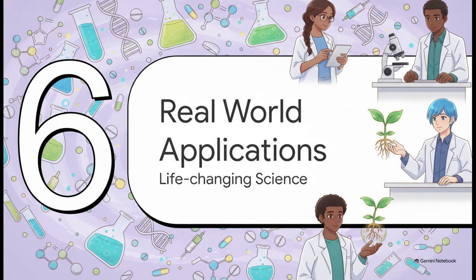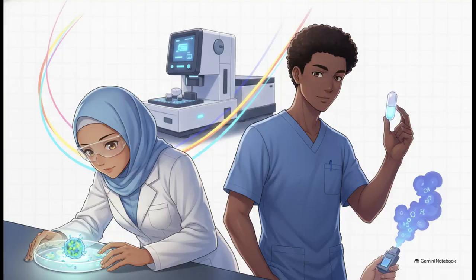And finally, Section 6, Real-World Lab Applications. This is the life-changing science. So it's time to bring all of this together. Why does this math actually matter to us? Well, just look at the applications here. In microbiology, serial dilutions are used to take a super dense soup of bacteria and dilute it down so far that you can actually isolate and grow a culture from one single microscopic cell.